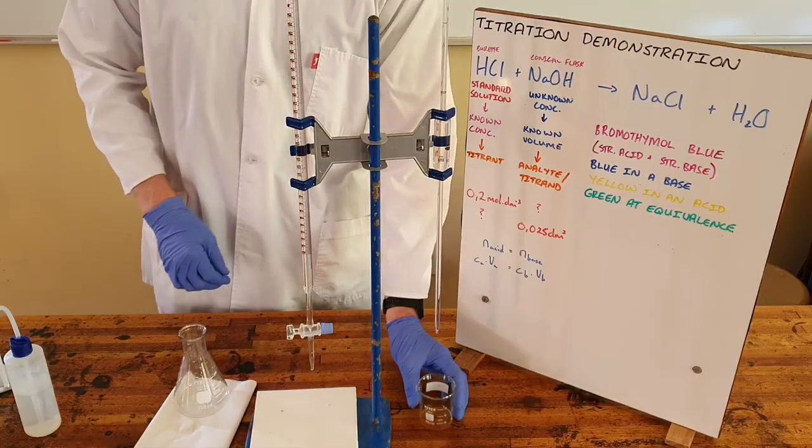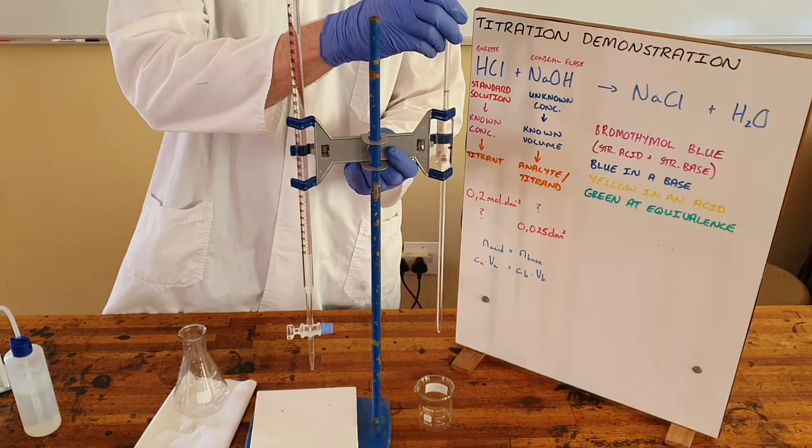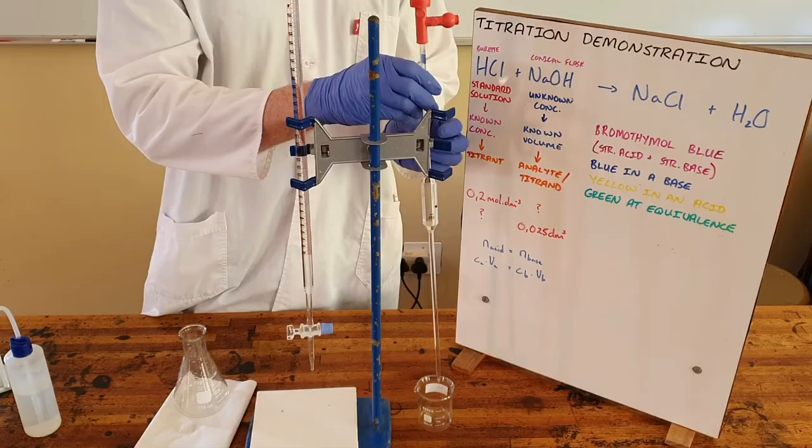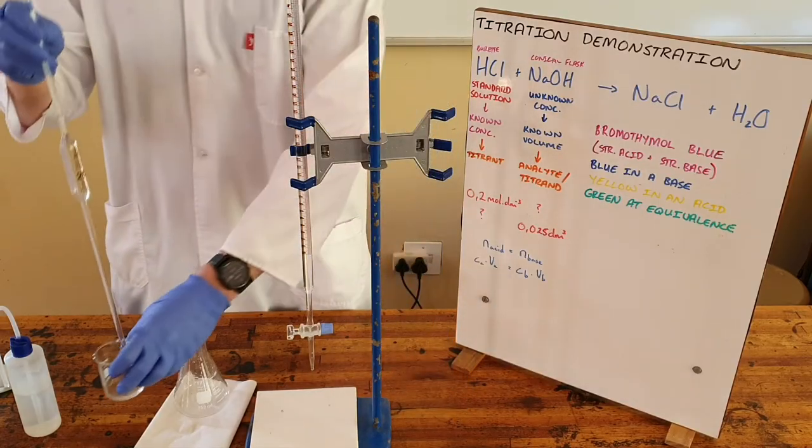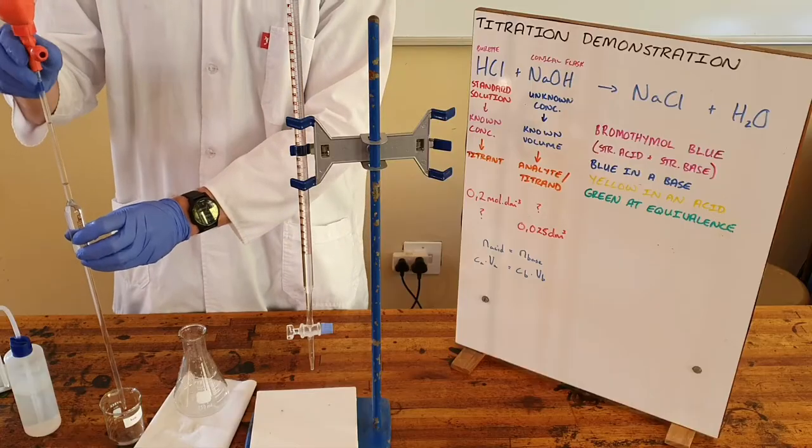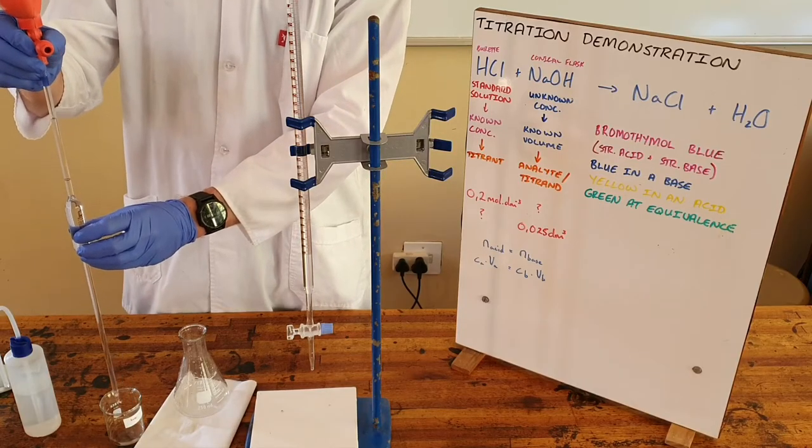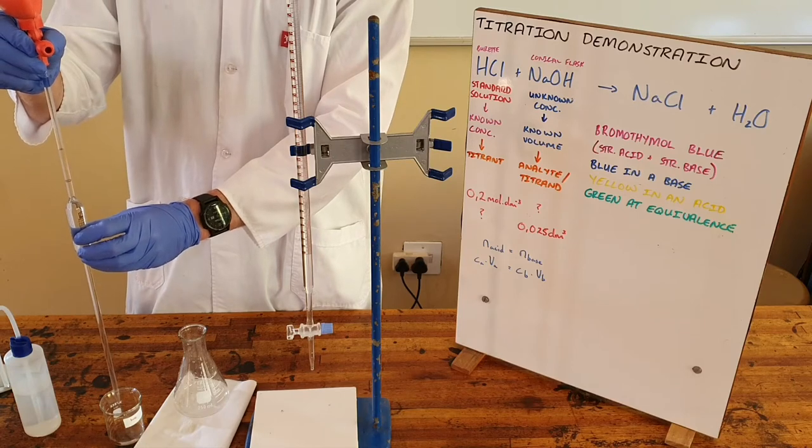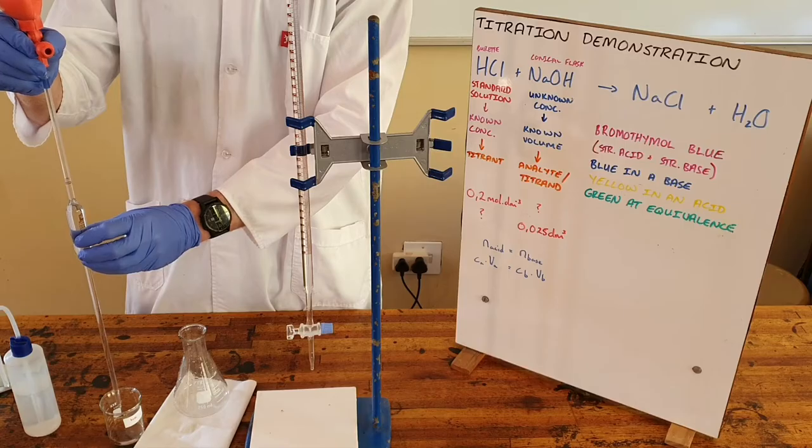So in order to get the known volume of sodium hydroxide we use a pipette. This pipette is marked as 25 milliliters or 0.025 cubic decimeters. We use this pipette filler to ensure that the pipette quantity exactly aligns with what it is marked as.